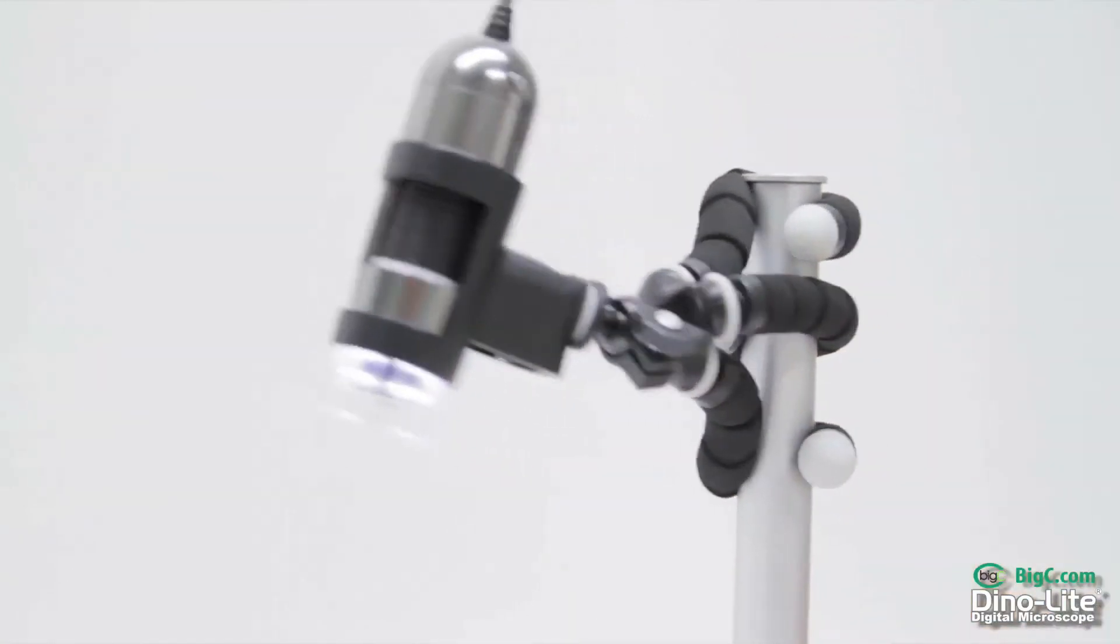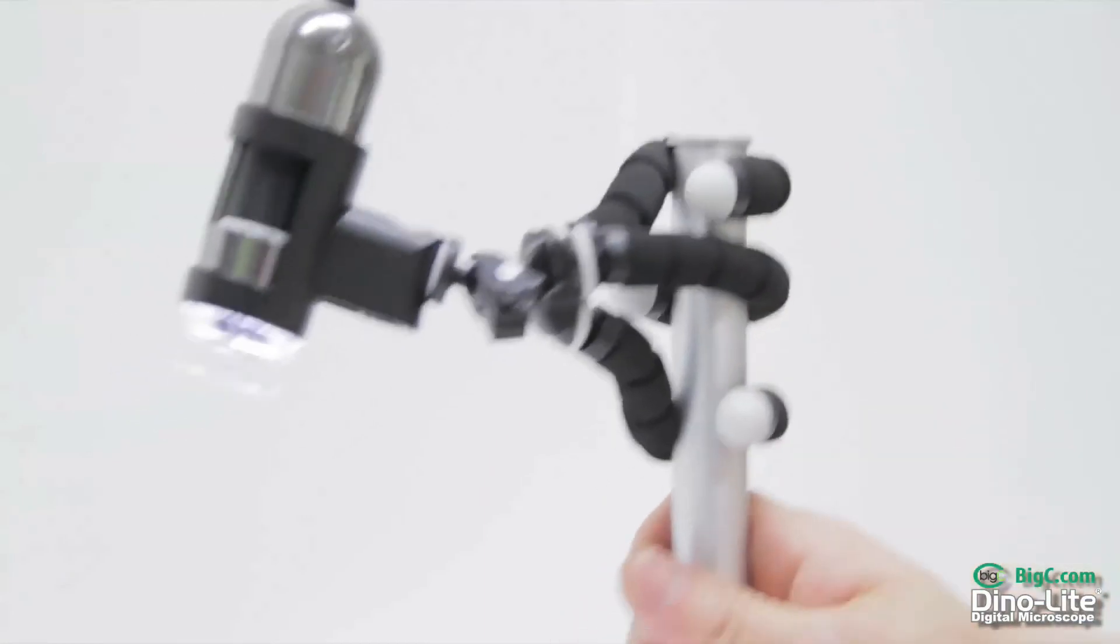The legs are strong enough to support your scope in any position on just about anything.